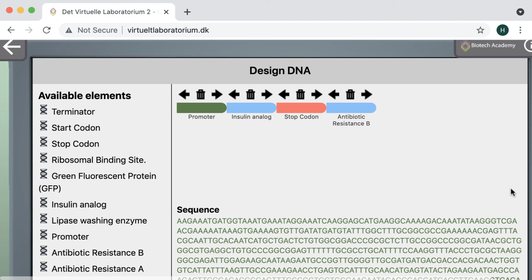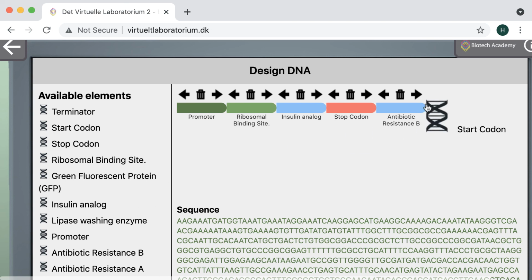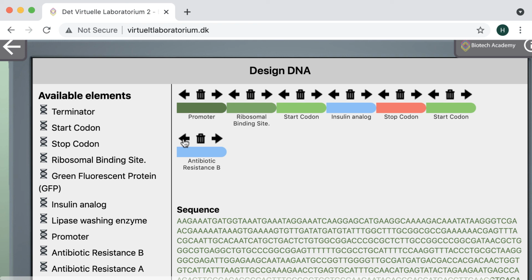Each of the two genes will need a start and stop signal. The overall DNA strand will need a promoter, then a ribosome binding section. The end of the DNA will need a terminator region. Build this recombinant or designer DNA. I strongly suggest having all teams show you the DNA design before going back to the lab.